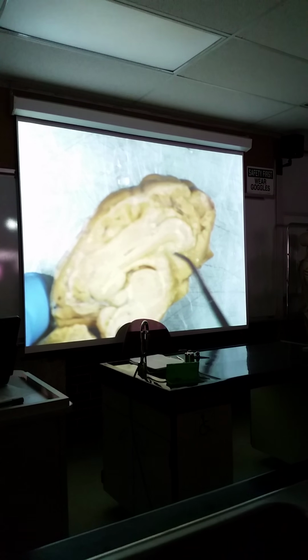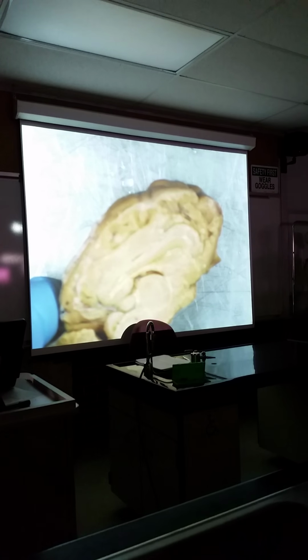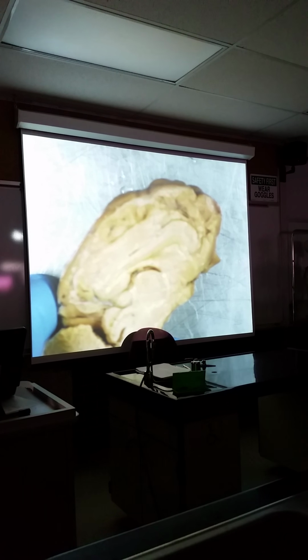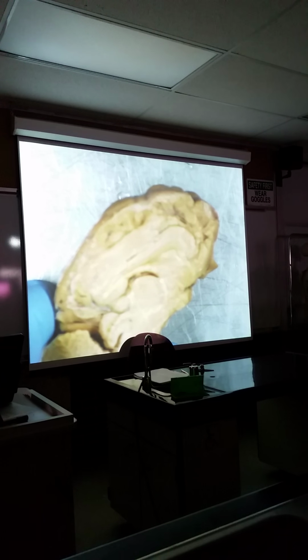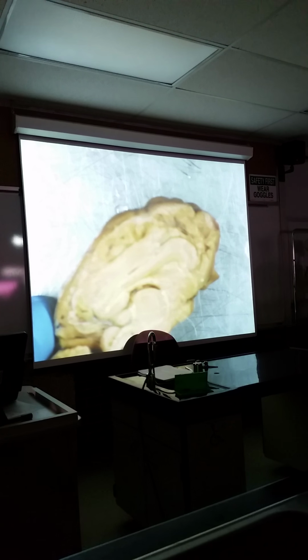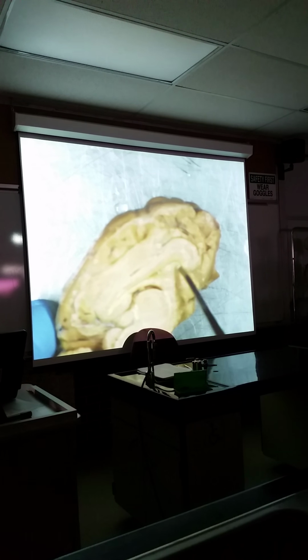I don't want to press too hard, I'll press through it. I would bust right through that, and where would I be? The lateral ventricle. I do want you guys to bust through that septum pellucidum right there, and look in there and see a mass of dark red, grainy junk. It's the choroid plexus. You're going to say it looks like dried blood. It is blood, and it's kind of dry, kind of wet. It dried out because the brain was dead, and then it got wet again when we soaked the brain in formalin. But it's choroid plexus of the lateral ventricle. But I don't want to push through your septum pellucidum. I want you guys to do that.